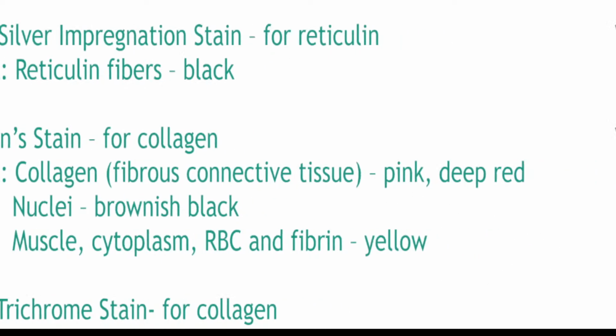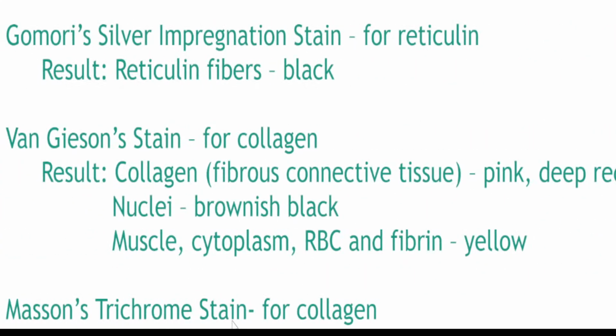Next, Masson trichrome stain for collagen. Collagen and mucus remain blue. Keratin, RBC, and muscles are red, and nuclei are blue-black.